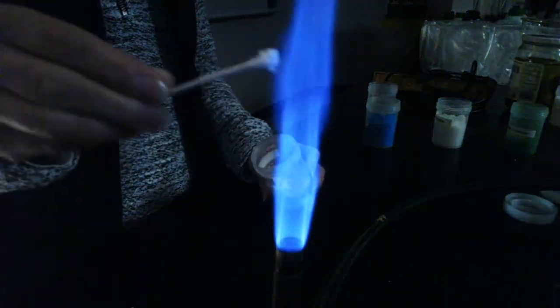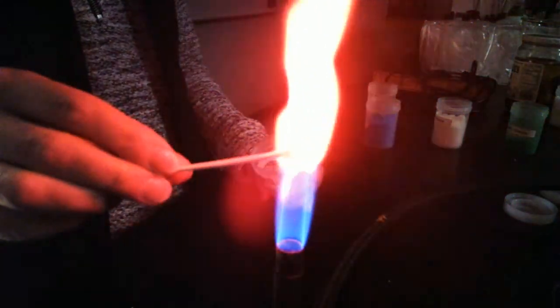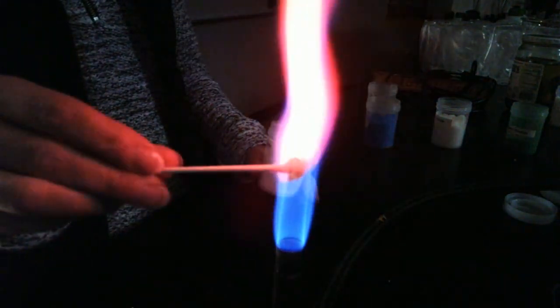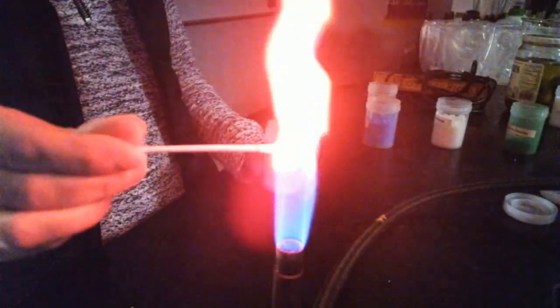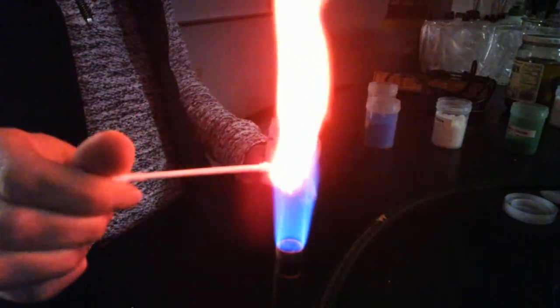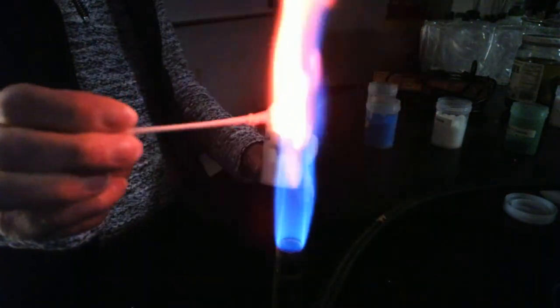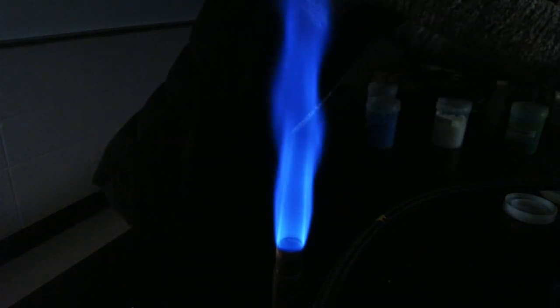Here's strontium. So it's strontium chloride. And so I got my wet Q-tip. See that one? This is another one that's kind of an orangish red almost. And you can see it's a different color. I don't know if you can see the red in there. But it's a nice pretty orange red. It's really cool. But again, maybe a lower energy color on average. There's a little bit of red in there. And so the electrons are making lower energy jumps.